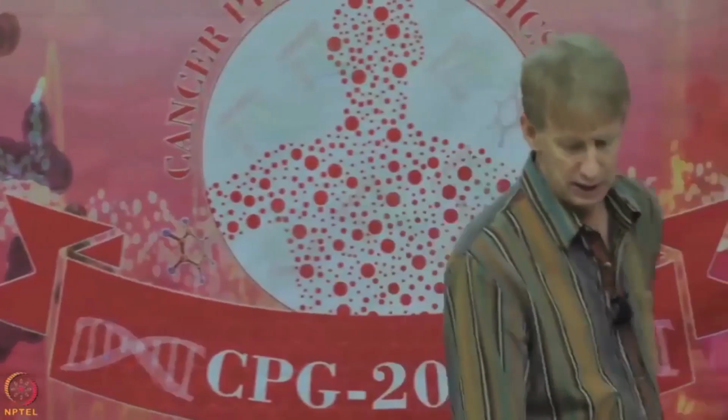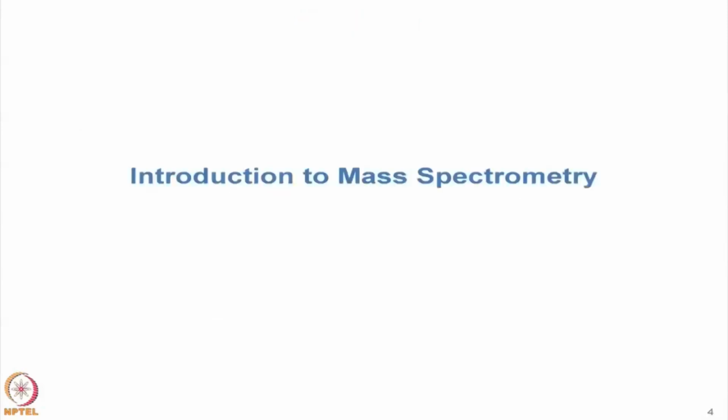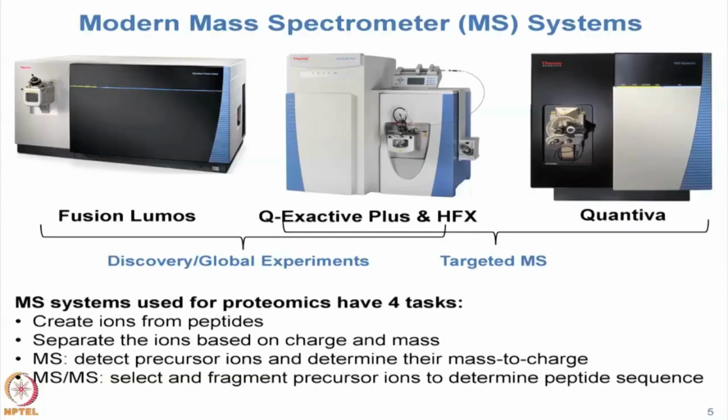If you've seen the description of what this session was supposed to cover, it looks like this. As I put all the slides together, I decided not to have them in quite that order. So the general flow of sections that I'm going to go through is illustrated here. And so let's get started. All right. So the first section, I'm going to teach you some of the basics of mass spectrometry.